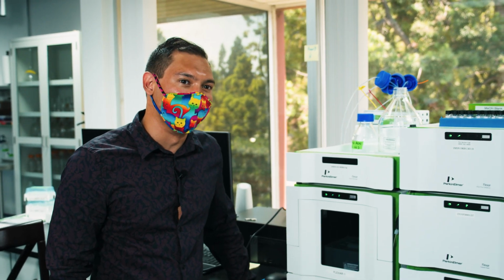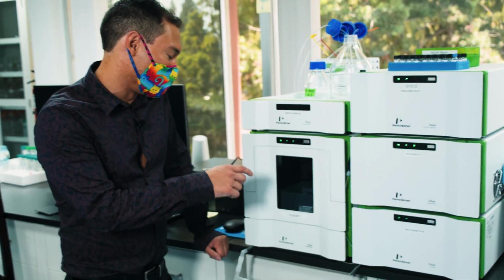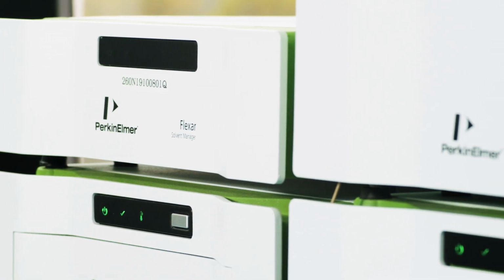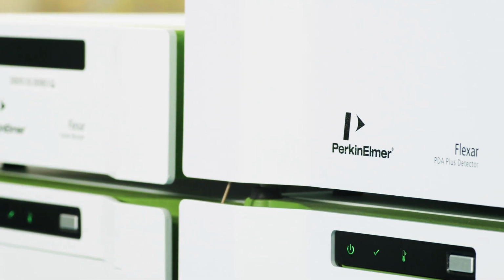So basically what will happen is that amber vial that we prepared earlier, a small sample of the liquid within it is going to be collected by the syringe in here, and it's going to get injected onto a column. And that column is going to be separating out all the different components within the sample. At the end of that column is a detector, the photodiode array.